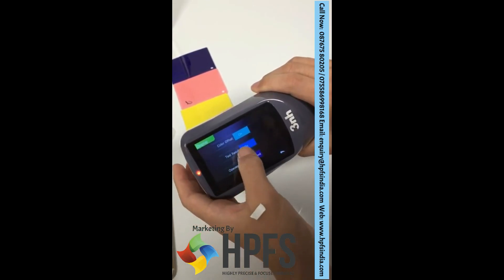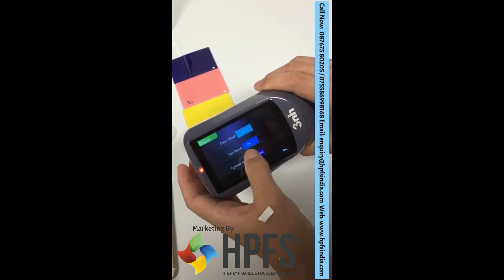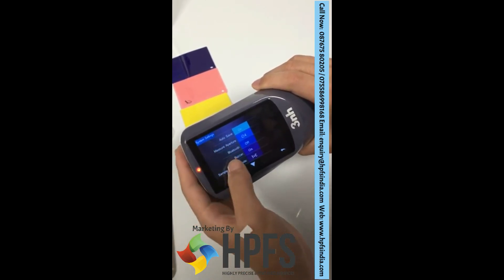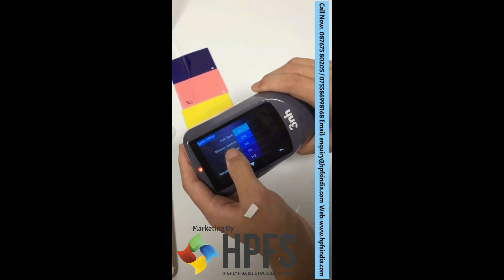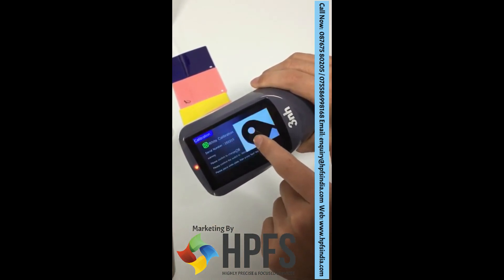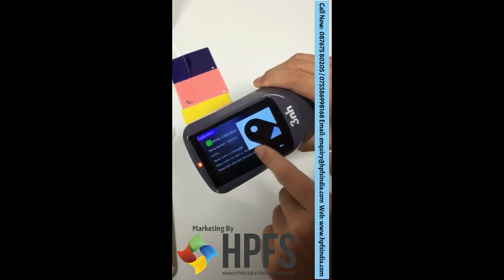Display color offset — turn on or turn off. Test result — turn on or turn off. System settings. Measuring aperture: every time you change the measuring aperture, calibration is needed.